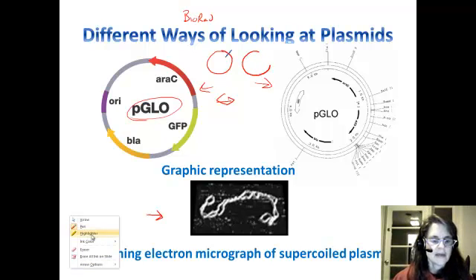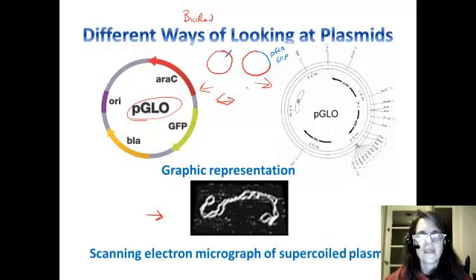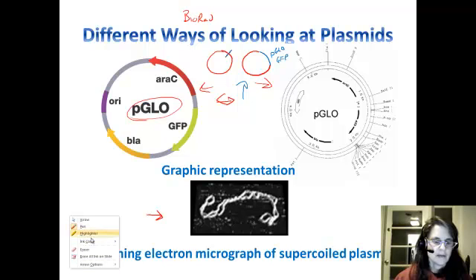And then into that plasmid, Bio-Rad will insert a foreign gene, in this case the gene that codes for green fluorescent protein. They insert it there, and then they ship this engineered plasmid to us. They actually ship a bunch of them in a teeny little vial. And so they ship this plasmid to us, and then we are hopefully going to try to make bacteria take up this plasmid.